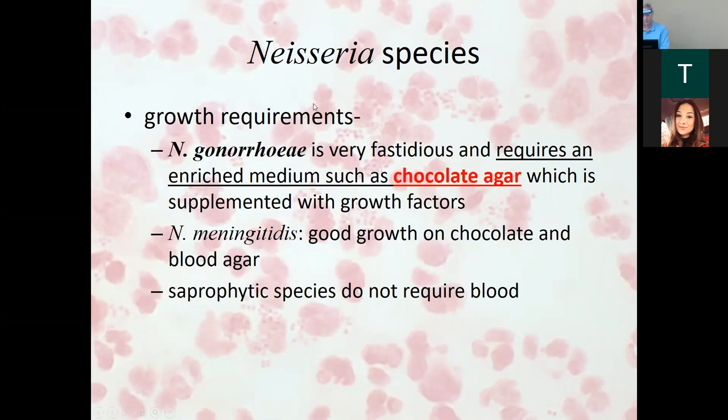Now this is real neat because this can be helpful and it can be harmful for setting up growth for these. So far we've set up staph and strep on blood agar. I think we brought out an E. coli the first day, on MacConkey. So we're looking at gram negatives, right? Who have we seen so far that's gram negative out of everything we've done?